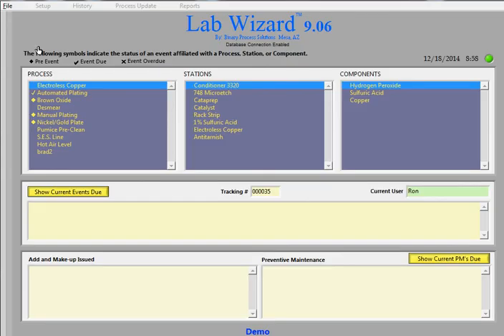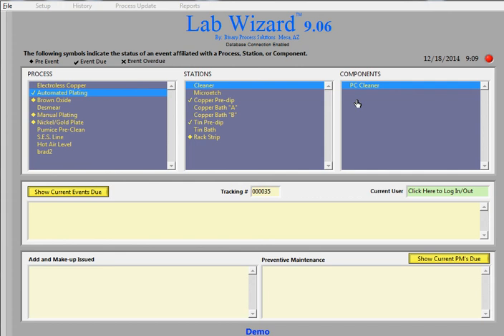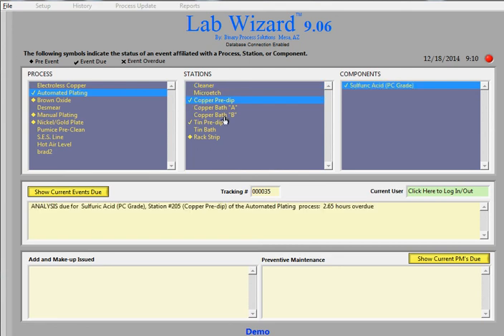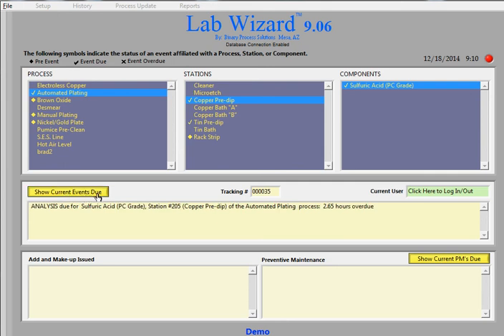So right now there's one check mark. A check mark means that there is something due. So when the check mark appears, you'll see a red light turn on right here. And this station has a check mark by it. So we'll click on that. And it's saying right now there's sulfuric acid component that needs to be looked at. So right here we can see preview upcoming events or show current events due. In this case, it's analysis due for sulfuric acid. Station 205.